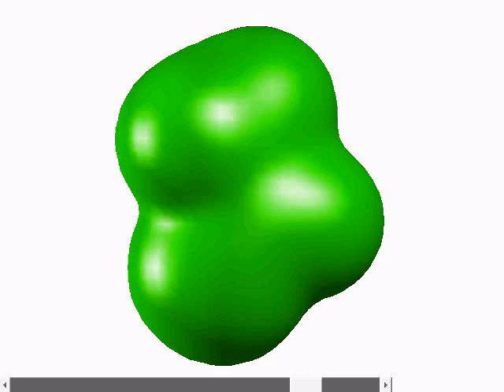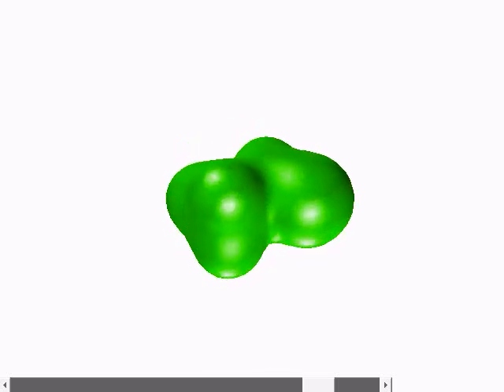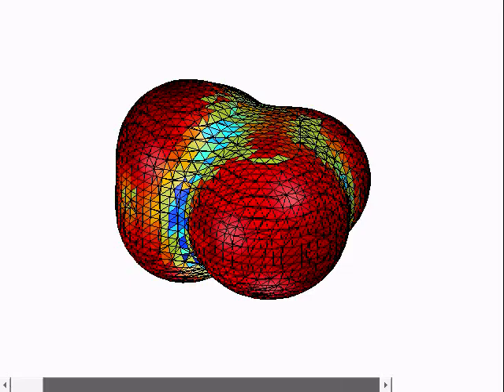Electron density is a real valued function over 3D space. The structure shown here is an isosurface of electron density. As the associated electron density value is increased, the isosurface shrinks. However, it still roughly resembles the surface of a collection of spheres. We find spherical patches on such surfaces and associate these patches with atoms of the protein.